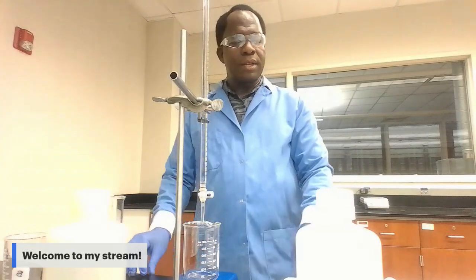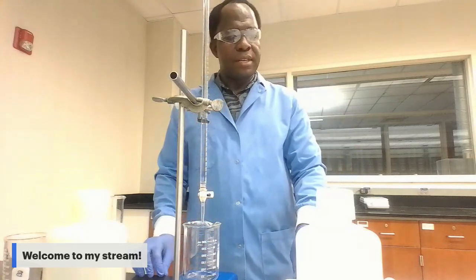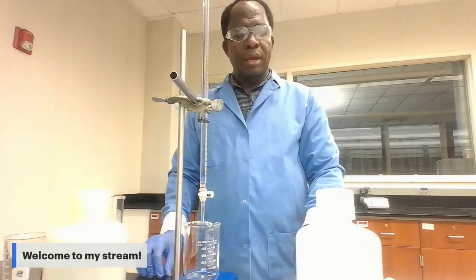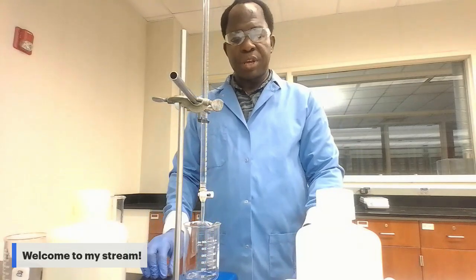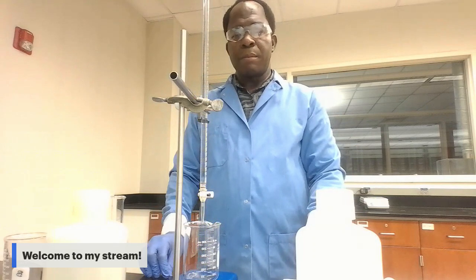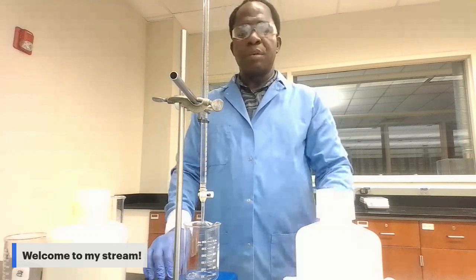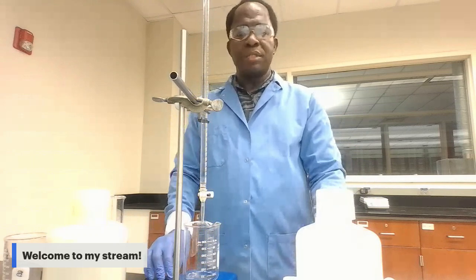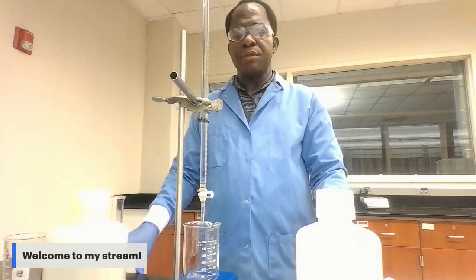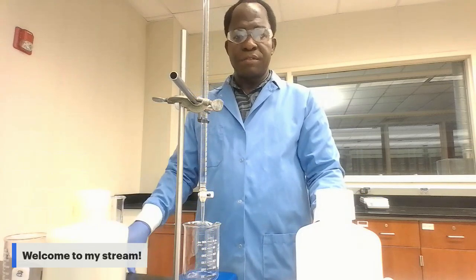This is the determination of the Ksp of a slightly soluble compound experiment. Before we talk about the goal and purpose of this lab, let me remind you one more time about the safety procedure of this lab.